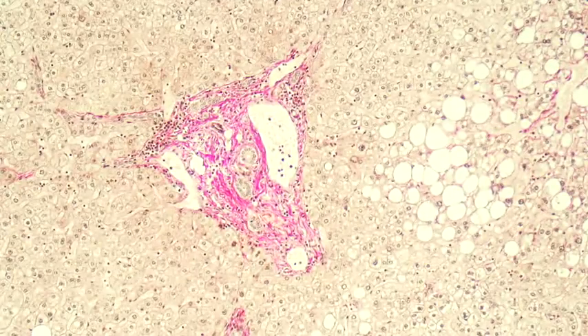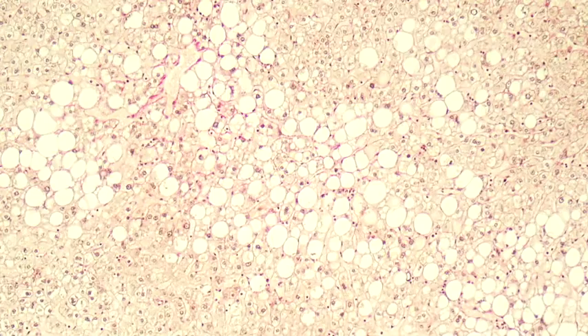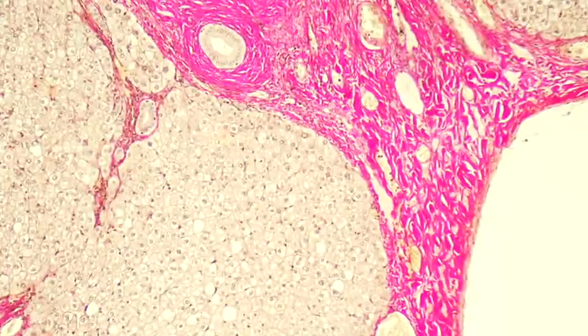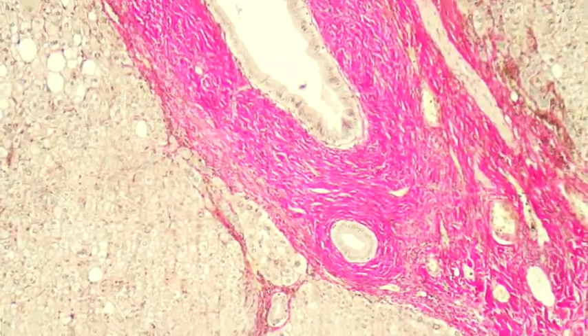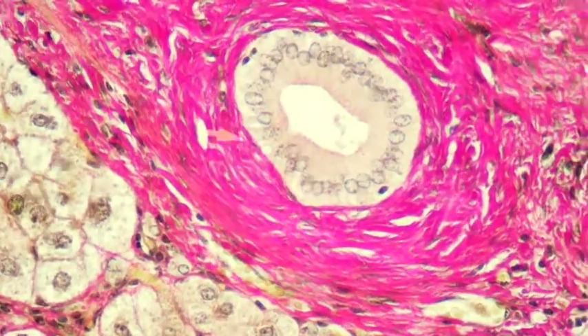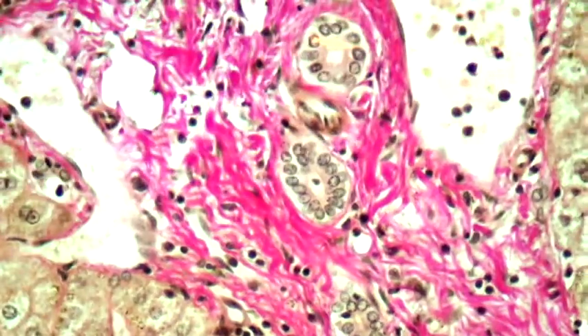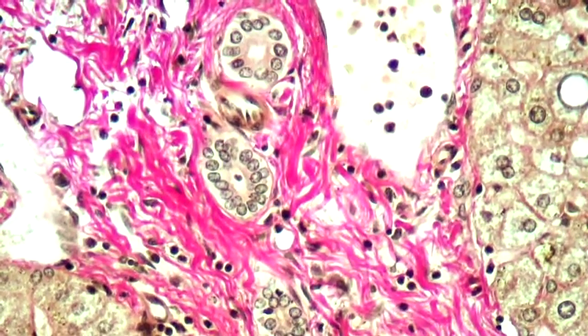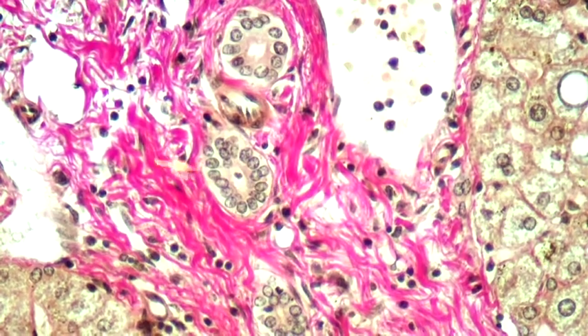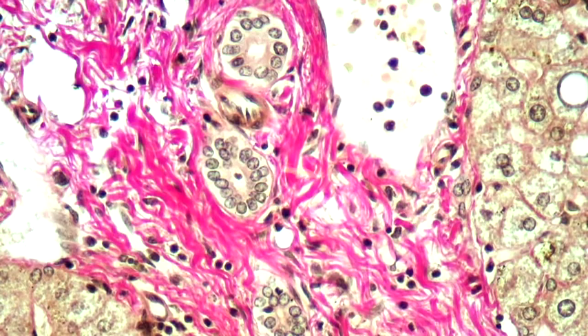Switching to the other section, which is liver — it's quite fatty as you can see at low power, with lots of lipid spaces. Over at the edge there's a nice large piece of connective tissue running through. The hepatocytes themselves are quite yellow with picric acid, as is the bile duct, with a couple of smaller bile ducts visible. This is a fairly thick section as you can see from the layers of nuclei, but there are some nice bright pink collagen fibres in the connective tissue. So that's worked out just right.